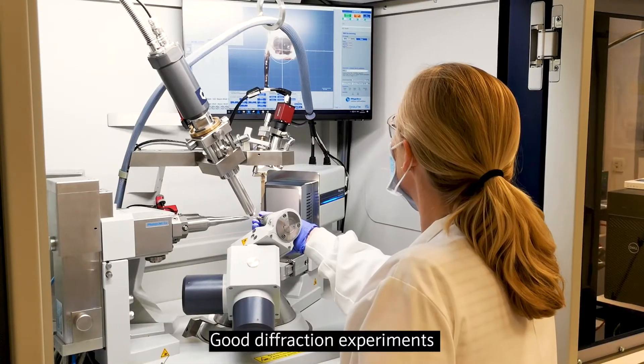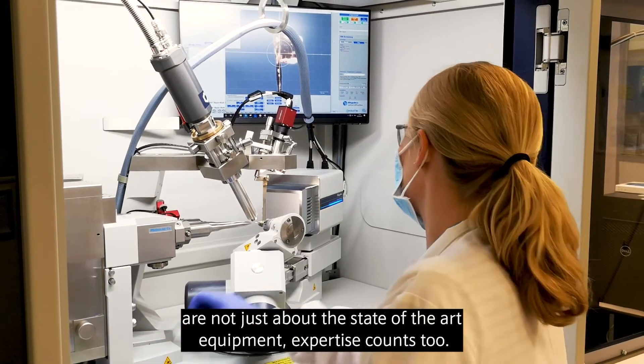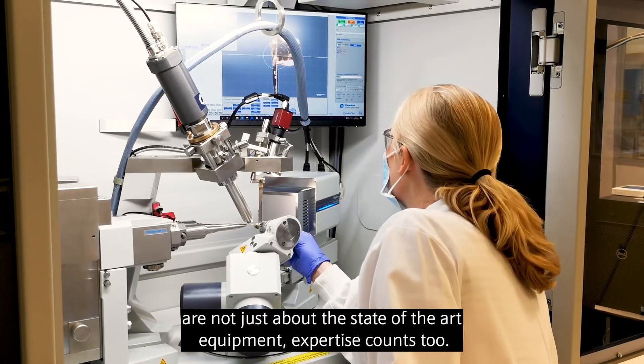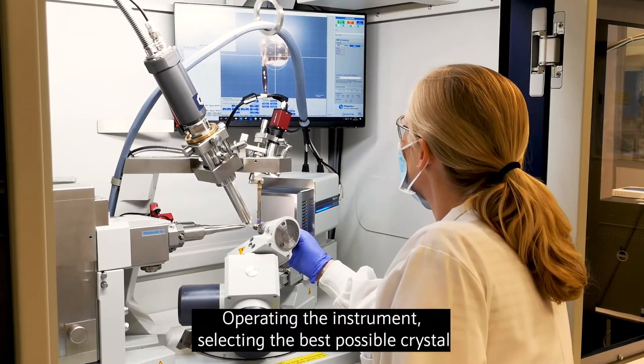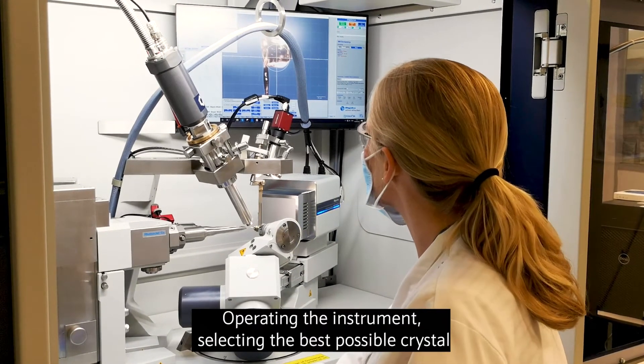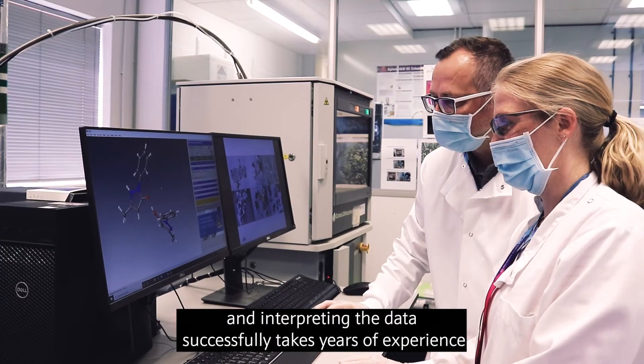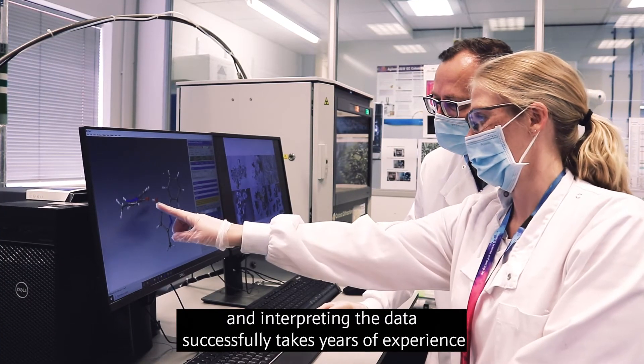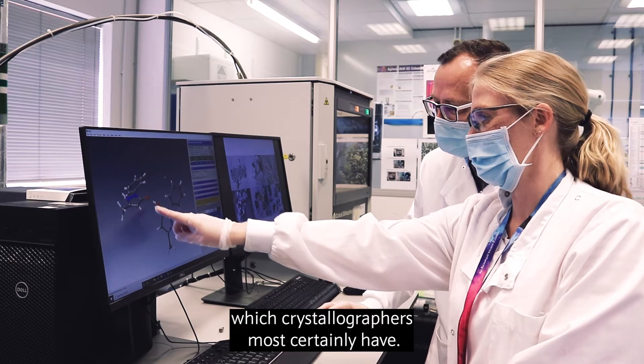Good diffraction experiments are not just about the state-of-the-art equipment. Expertise counts too. Operating the instrument, selecting the best possible crystal, and interpreting the data successfully takes years of experience which our crystallographers most certainly have.